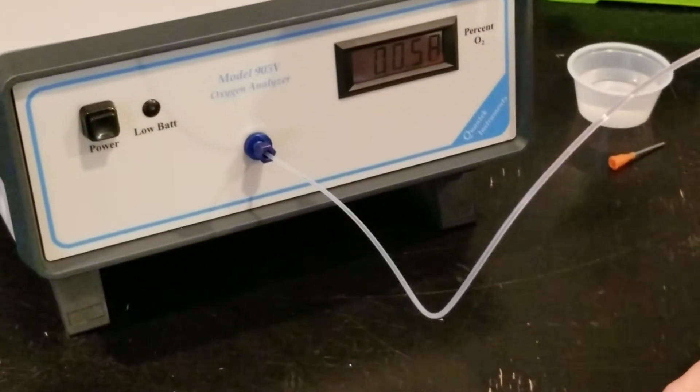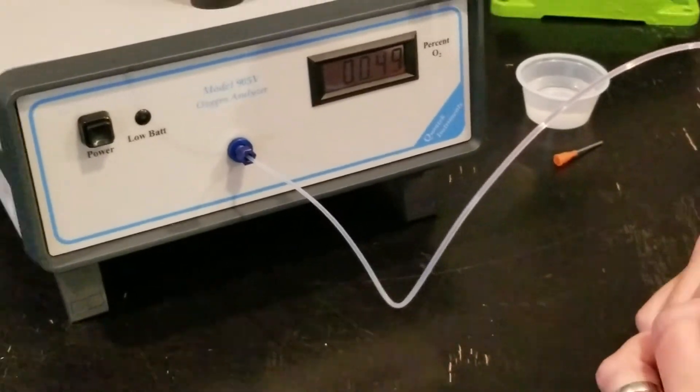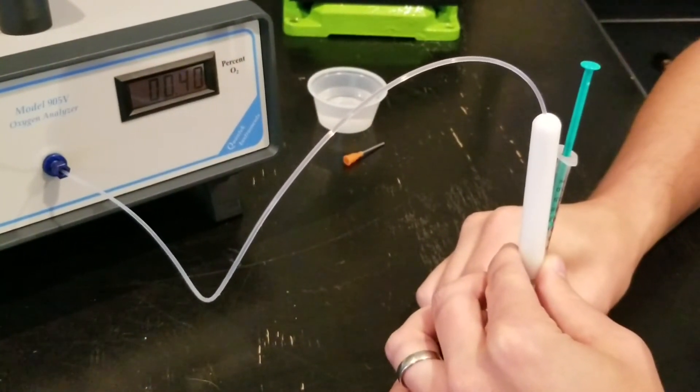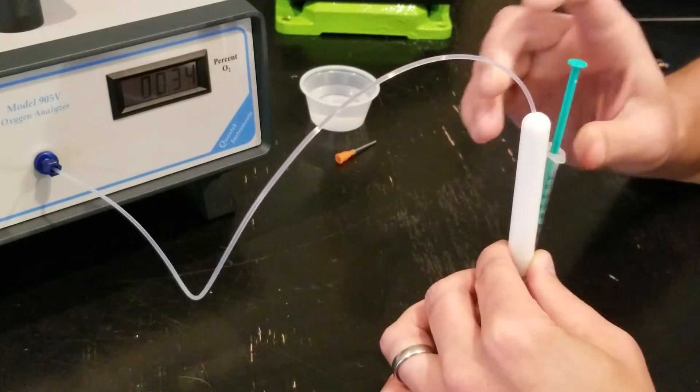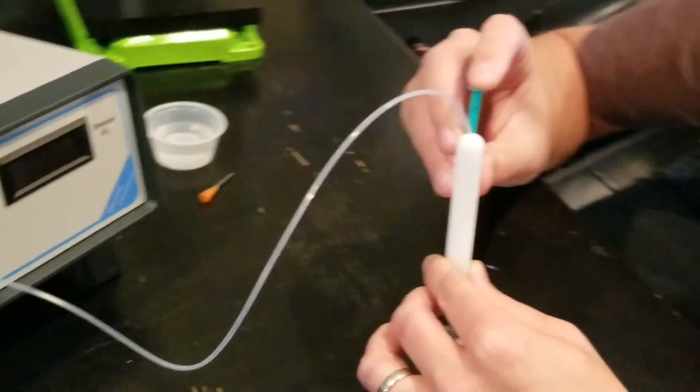So now we have 0.4 cc's. This vial is incredibly well flushed — we're getting down to 0.35, 0.34, which is very good. I'm going to do a full half a cc.